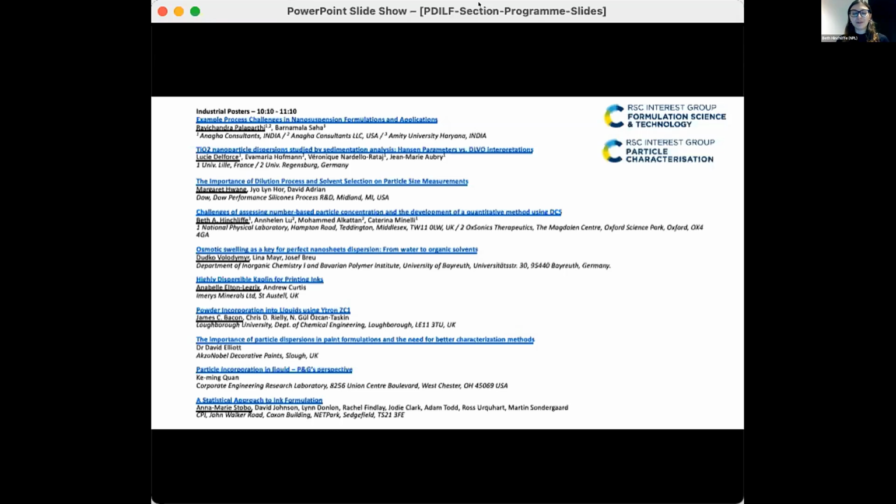Do you want to look at the number-based distribution or the volume-based distribution? And this is something that I think we all probably encounter on a regular basis, and making sure that you're using the right distribution and converting between the two correctly, if that's something you do, is really important.